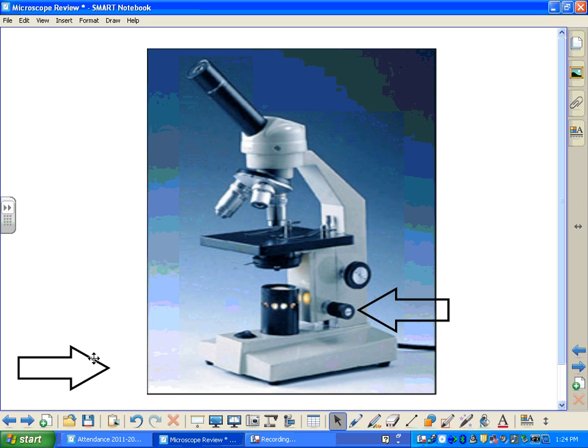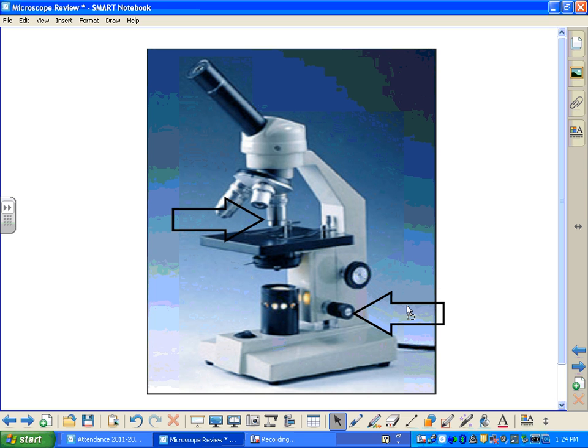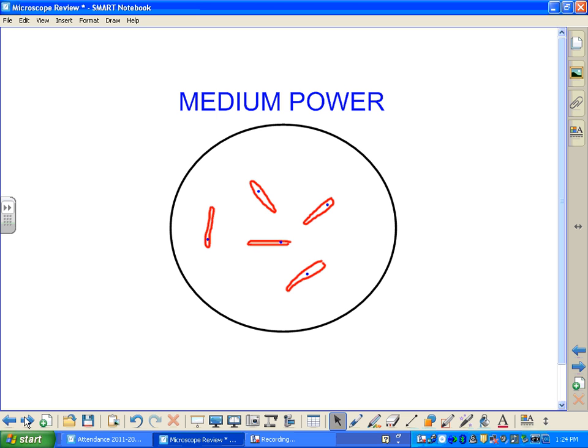So now we're going to switch to our medium power lens or objective. Once again, when we look through, we're going to use our coarse adjustment knob and our fine adjustment knob to focus on our specimen. Here's our specimen under medium power — we'll see several cells here, focused pretty well. The next step is to make sure that at least one of the cells is in the middle of our field of view, so we would move the slide itself until that was the case.